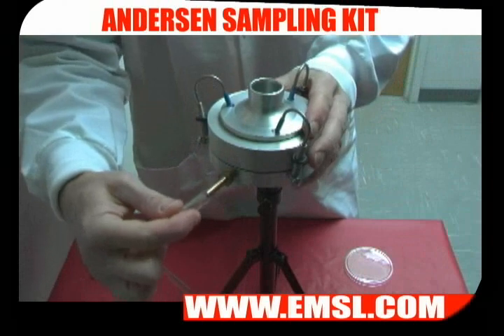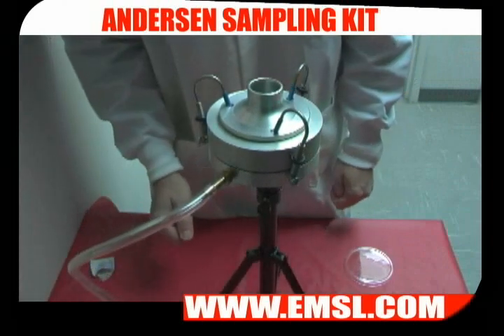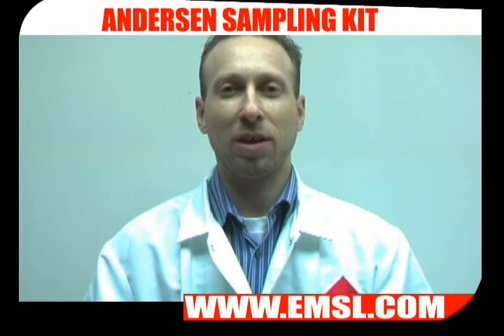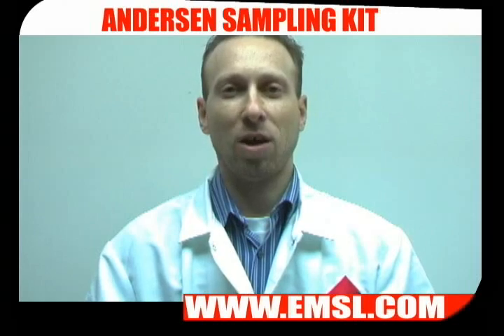Next, attach your tubing to your sampler, turn on your high-volume pump, and set it for 28.3 liters a minute. Please note, if this is the first time you're setting up your sampling apparatus, that plate was simply to calibrate and to set your flow rates. Please start with a fresh plate and follow all previous steps.